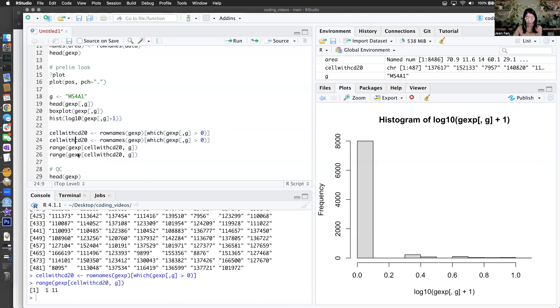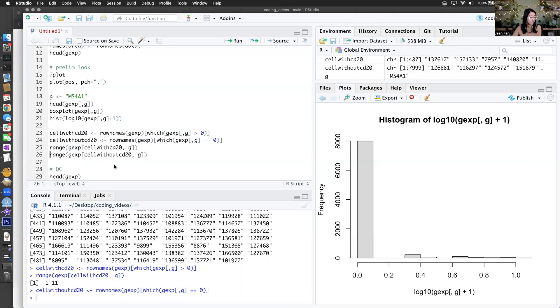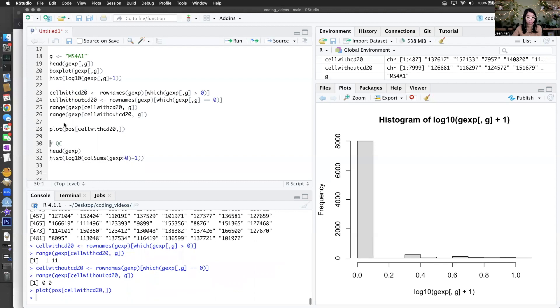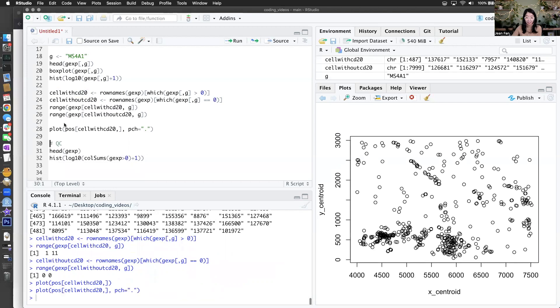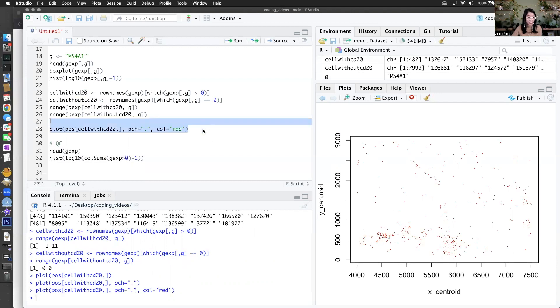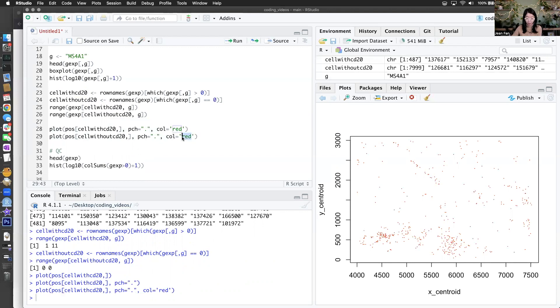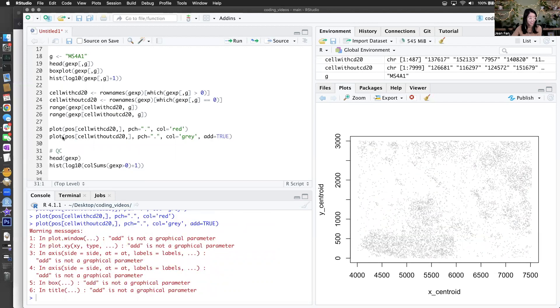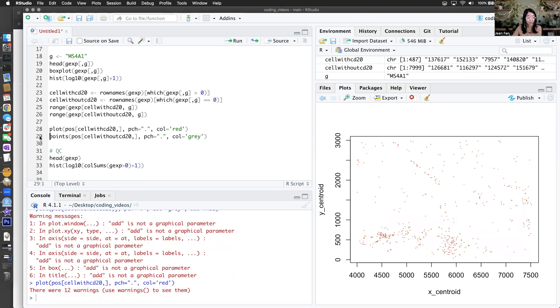Cells without CD20 are the ones that are zeros. Now I have cells with CD20, and maybe I just want to plot their positions. So this is where my cells with CD20 are — I'll make them red. Then I have my cells without CD20, maybe I'll make them gray. I want to put them all together using points. So I just want to see where my cells with CD20 are and where the cells without are.